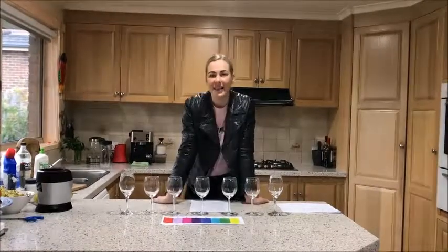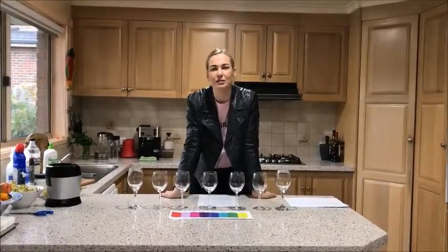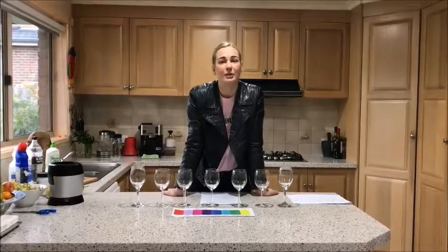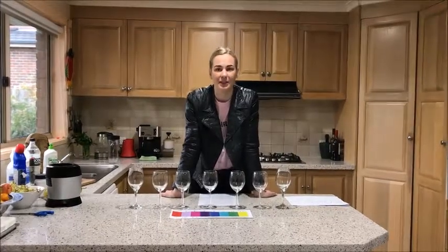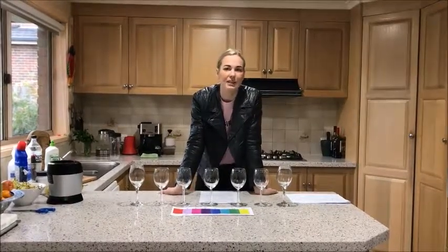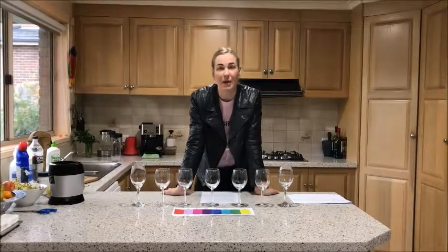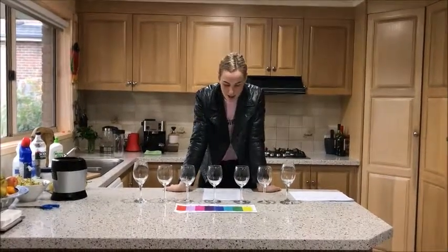Hey, my name's Tess and today I'll be measuring the pH of different substances found around the home. The measuring of pH is one of the most, if not the most, prevalent experiments done in laboratories. This is because pH is such a vital part of chemical and biological phenomena.